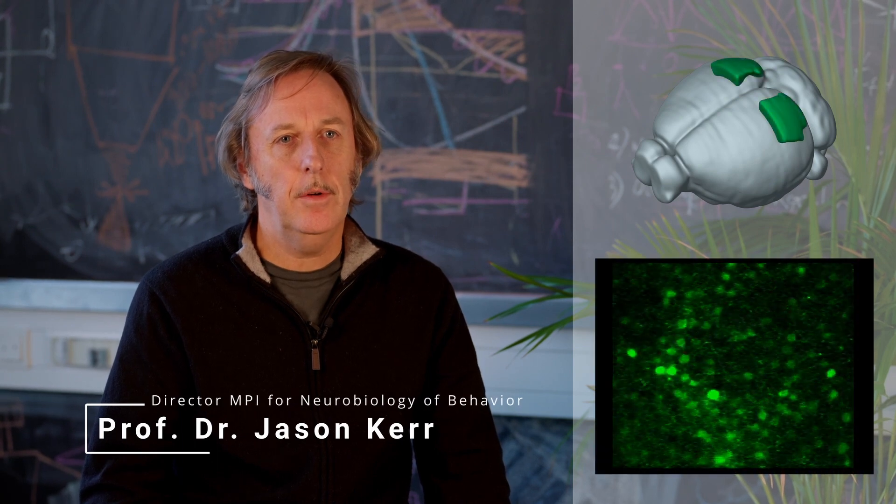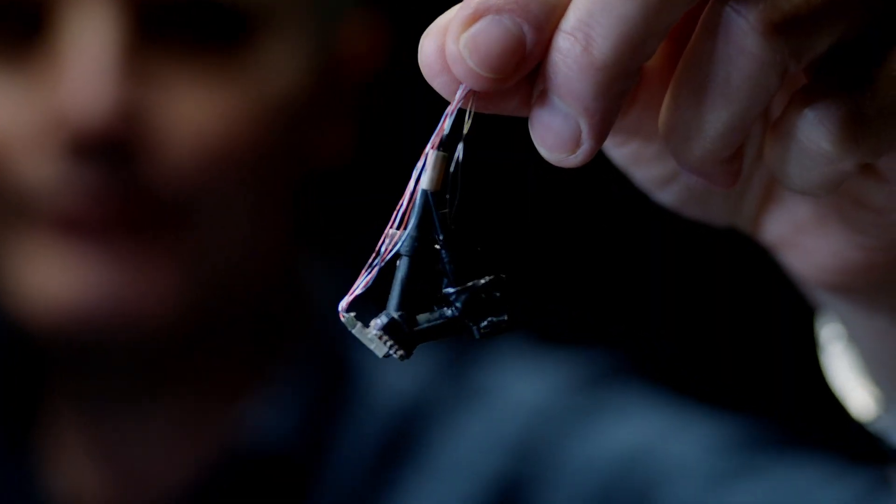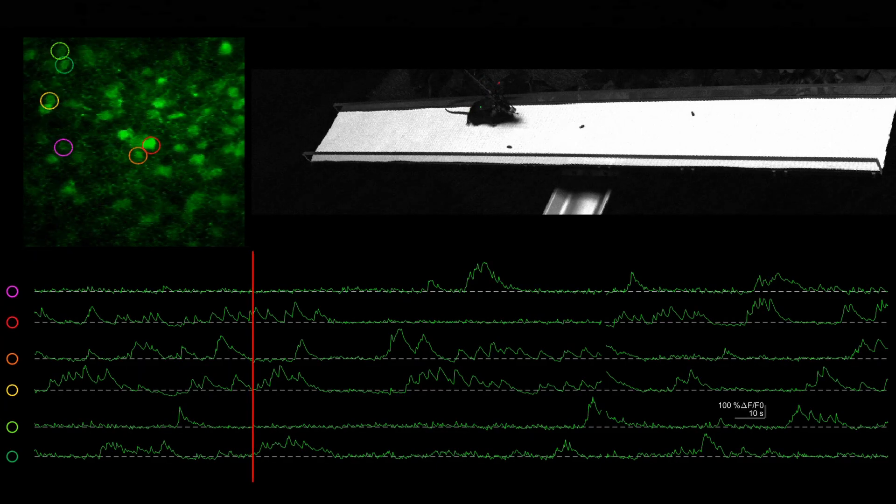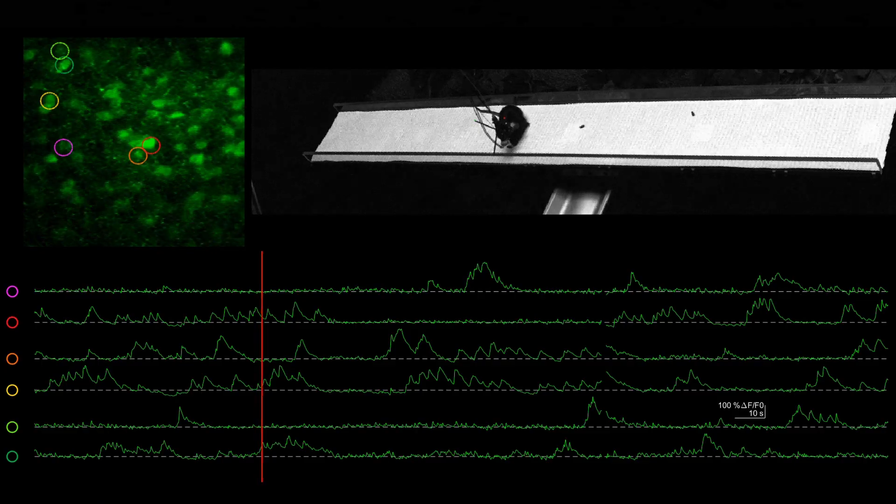We developed a microscope for imaging all layers of the cortex on a freely moving animal. It weighs around 2 grams, which allows it to be carried on the head of a mouse and does not interfere with the animal's behavior as it runs around and performs visually based tasks.